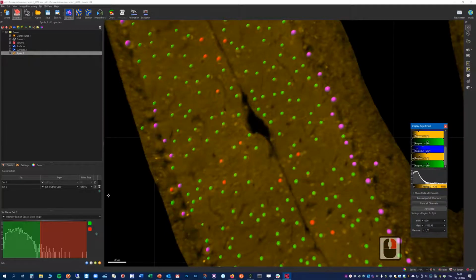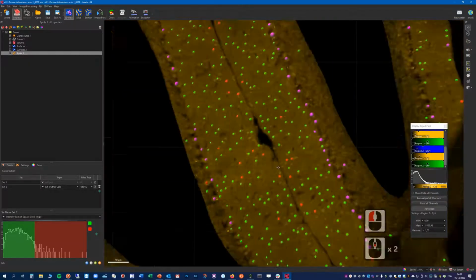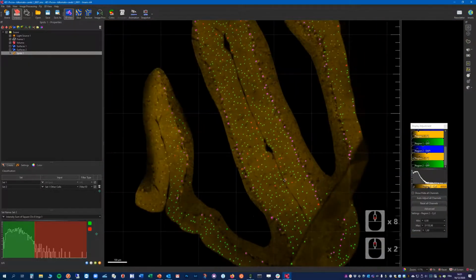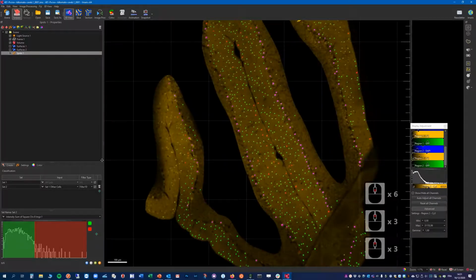Something like this. So, are the red spots on bright yellow cells? I think I'm still a bit too restrictive, and again we can see here definitely one population of cells and a second one, so we can probably decide this way how to separate the two populations. But obviously there are many ways of doing this kind of work.